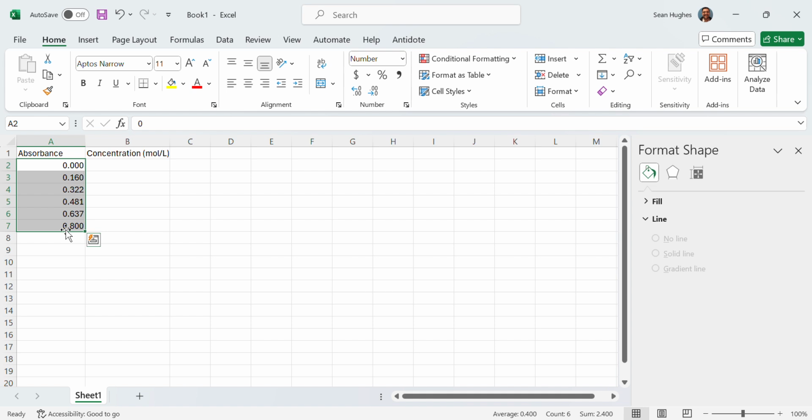Not that you need to produce this typed up data for me, but if ever you had to, you could always toggle the number of decimal places by playing with these 2 buttons over here in Excel. So you could increase the number of decimal places or decrease them as you will. When you want to type in your concentrations, this is another matter.